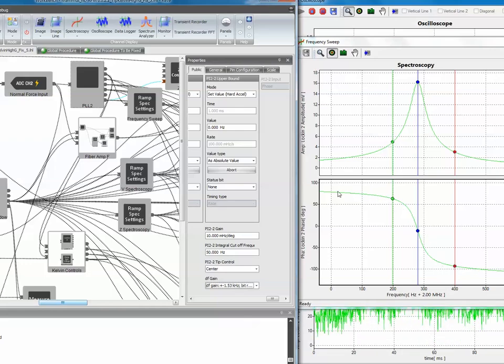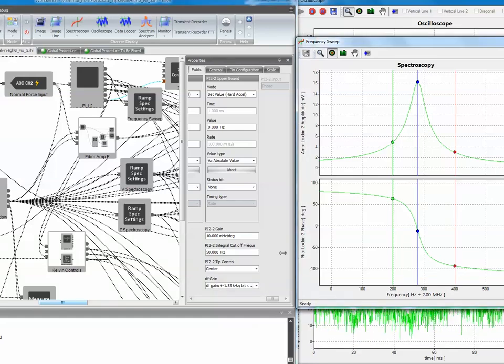If there's any weird peaks or dents in here, you might want to exclude them. This is the way to do it. You only have to do it once for one type of cantilever. This is not very critical. This setting does not affect any kind of gains. It's all compensated for. So whatever you set here is a one-time thing, and you'll never have to touch it again. But the first time you should look at it.